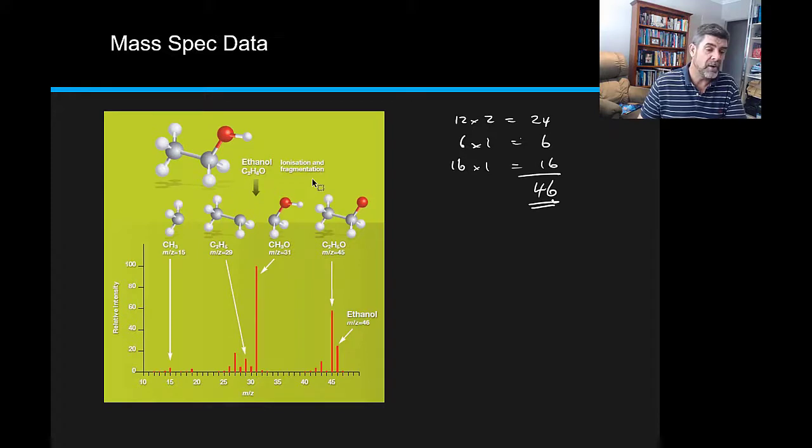Now we would go a lot more specific if we were to go through our calculations, but in actual fact, what we find is that it's just as easy to round these off to help you identify where some of these fragments might be. So the whole molecule would have a mass of 46 and you can see that the highest peak there is actually a peak of 46.